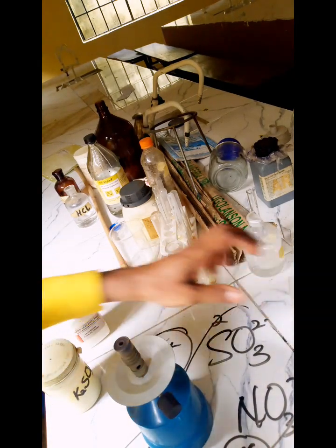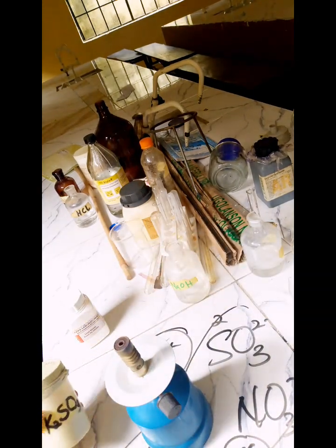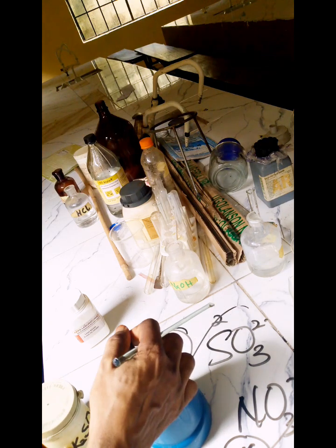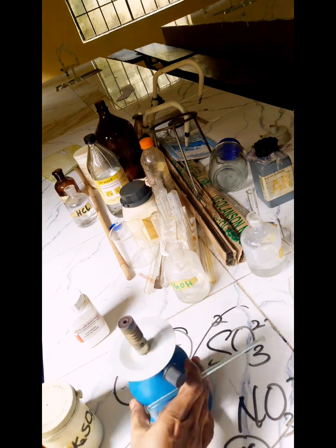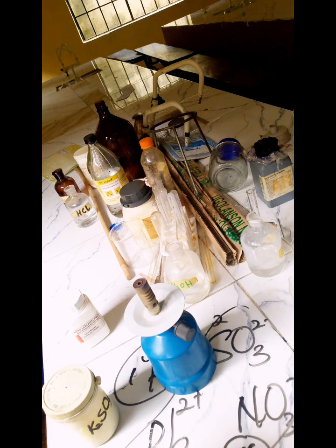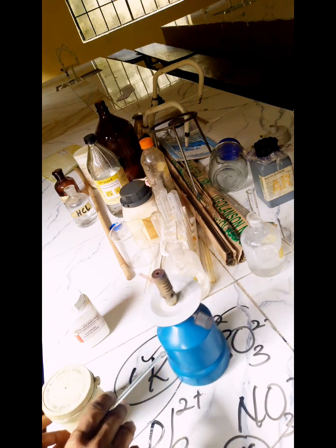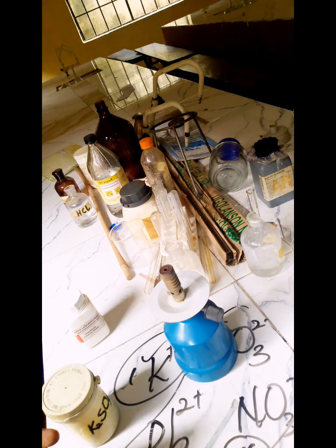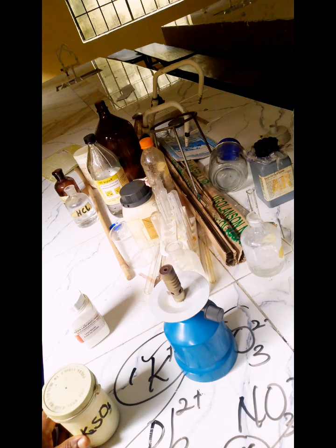To confirm potassium, you know that potassium gives a lilac color with the Bunsen burner flame. That's the only way. If students are required to identify potassium, it has to be through the flame test.